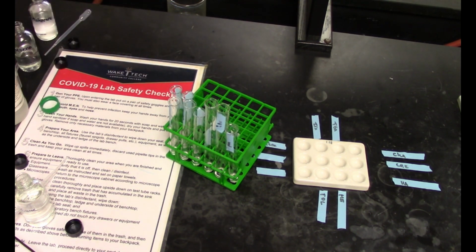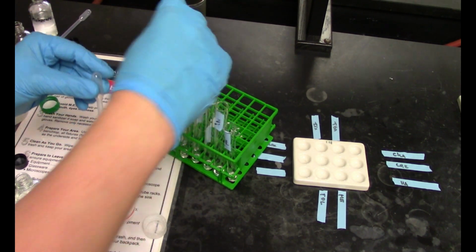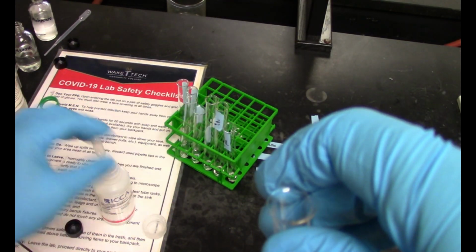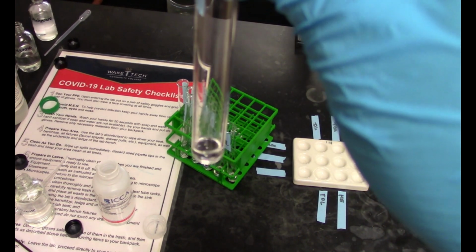So when it comes to the sodium metal test, we don't see any production of hydrogen or any reaction with sodium except when we're working with our alcohols. So what we're going to do here is focus on our 2 alcohols, and to these we're going to add a few drops of phenolphthalein, and this is a pH indicator that turns pink under basic conditions. Now we're not going to add it to these because this contains some methanol, and we know methanol is going to react, so give us a false positive.